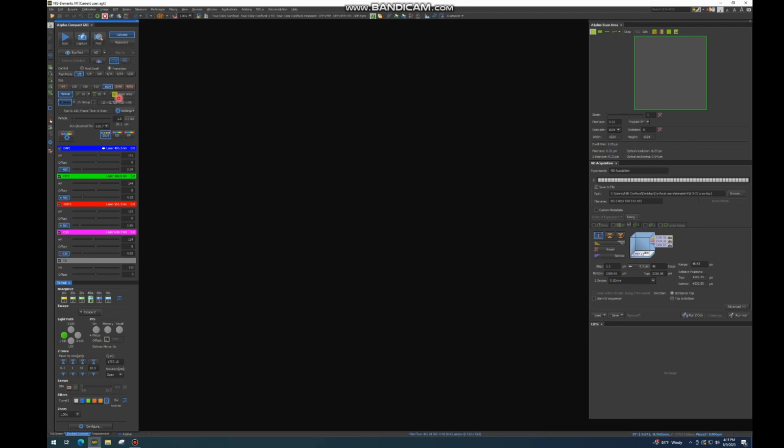So here you get into channel series and setup. You can arrange the channels in any way you want. Most people have this in a sequential form to where you get separate images for separate channels. But if you needed to do something more technical, you could adjust those settings.